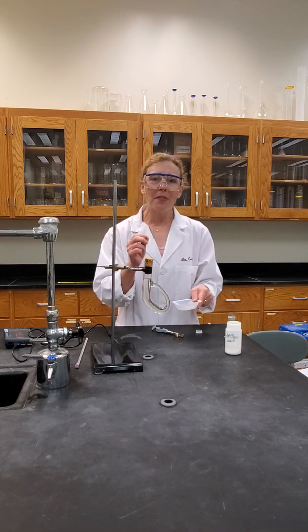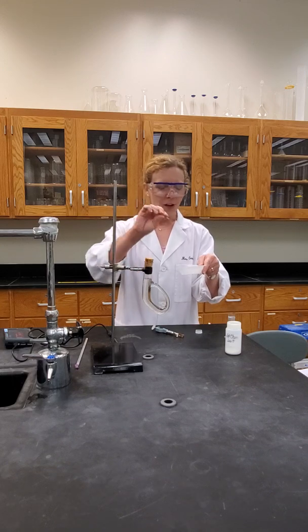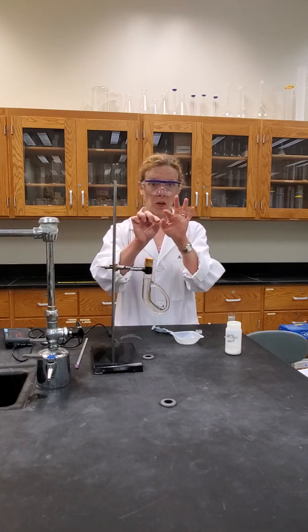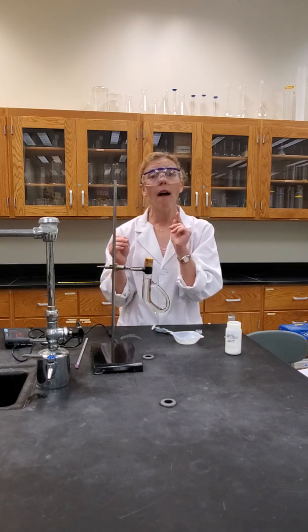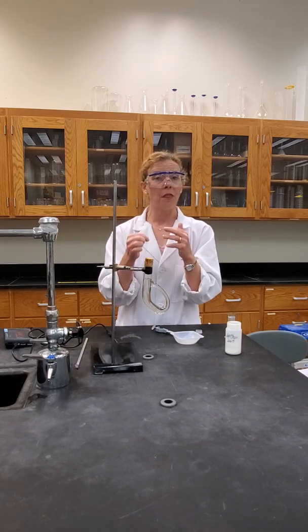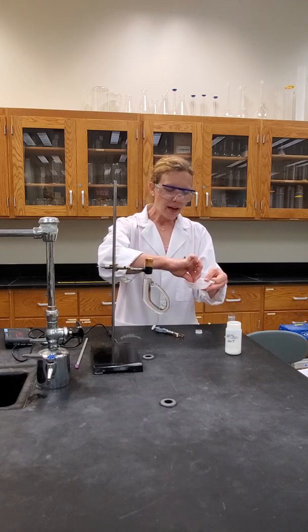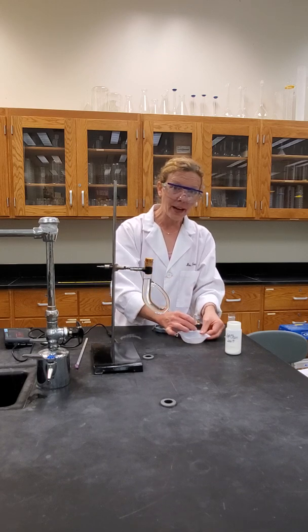I think the best method to load your capillary tube is to scoop and tap, being sure that you try not to come into direct contact with the compound. We just want to load the capillary tube. And you just have to add enough so that your eye can see the solid. So for my old eyes, I need about 1/3 depth of compound. So what I'll do is simply scoop and then tap it in, and scoop and tap it in.